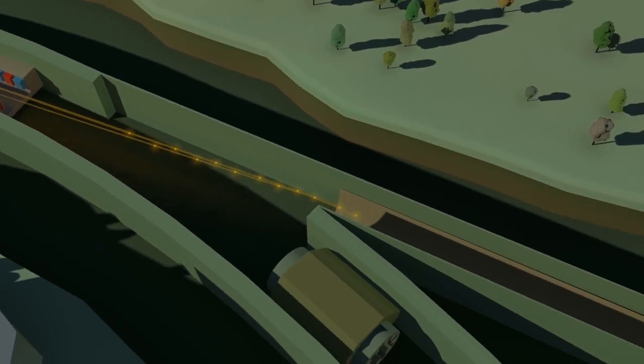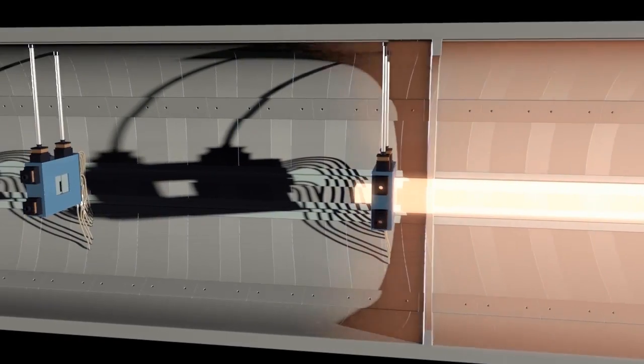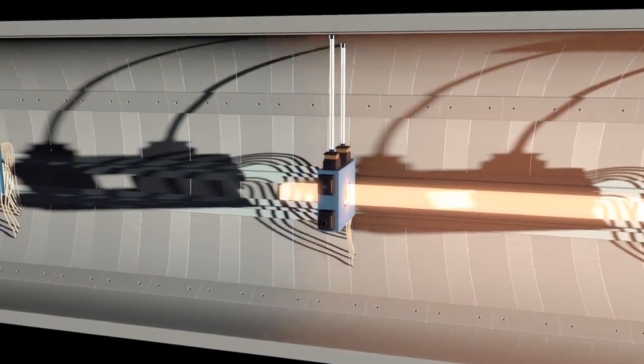These resulting beamlines are then directed towards the sample. But before they hit the sample, the X-ray wavelength is selected by a monochromator and the beam focused by mirrors and shaped by slits.